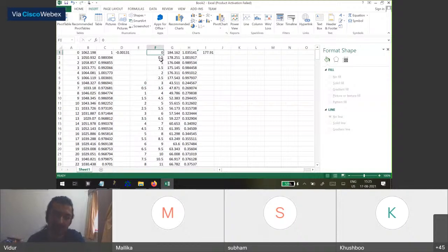So as an example, this suggests that it was 2 frames per second, since it takes 2 frames in 1 second. If it was 3 frames per second, the difference between two cells should be 0.33. If it's 4 frames per second, it should be 0.25. So that's something that you'll have to manually do.